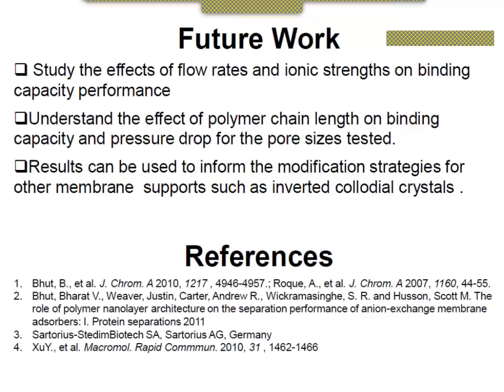The pore size we would expect to be most affected by lengthening chains is 0.2 micrometer, because their pore sizes are so small that it'd be easier for clustering to happen. But we have yet to test the effect of length on the pore sizes, and that's what I'll be testing next week.